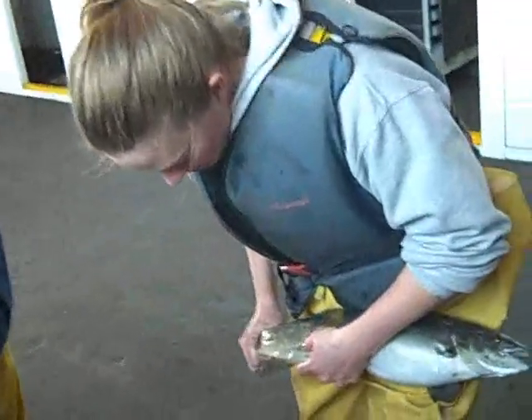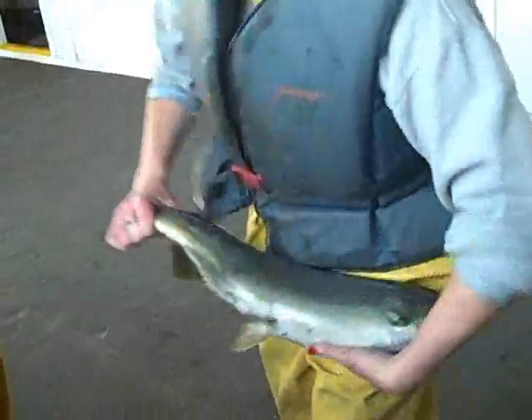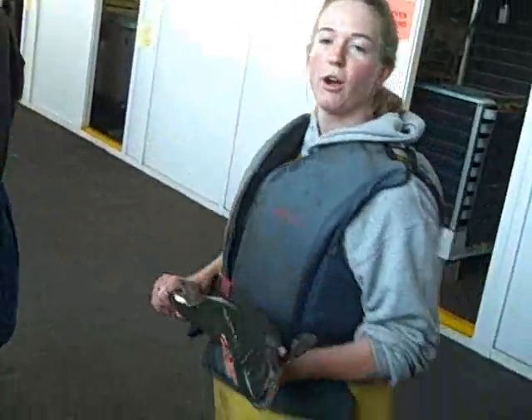We'll check them to see if they're mature. Not mature. So then we put it in our holding tank.